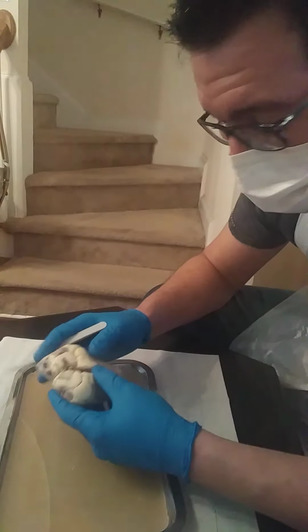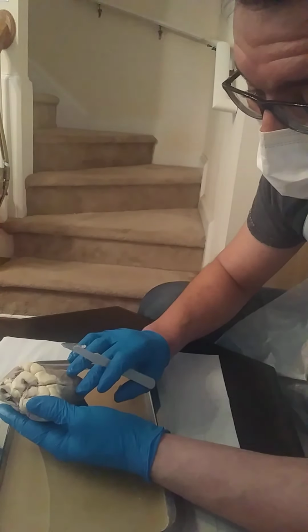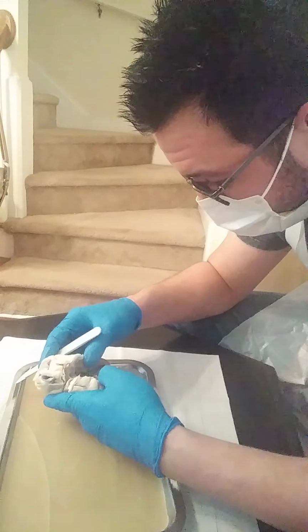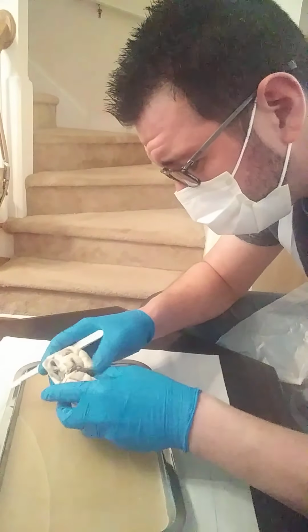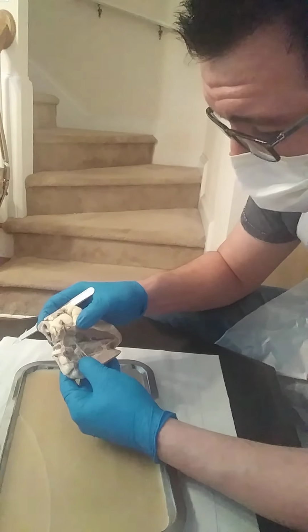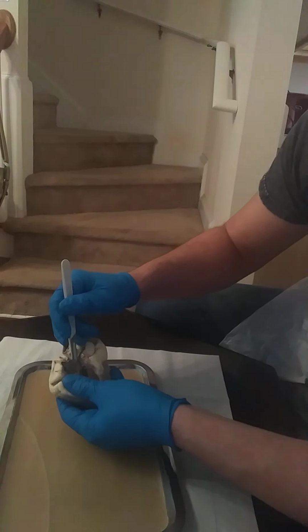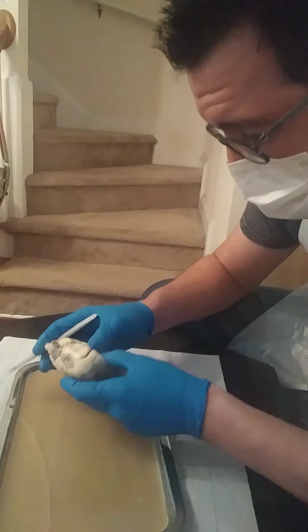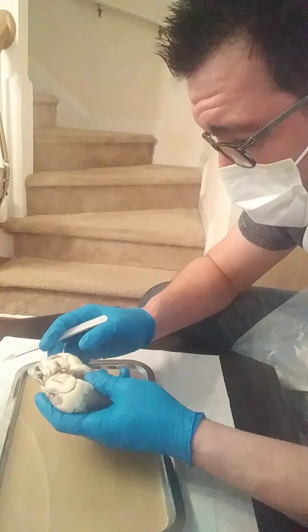The interventricular septum would be the bottom two parts, which I'm hoping to have cut through. Would be the bottom two portions of the ventricles, the wall that separates them. I'm gonna have to just cut it open a little bit more. There we go. There it is. All right, that's a little bit better. Okay, so here is the tricuspid valve, and here are the papillary muscles, right there. And let's see if I could crack open the left ventricle a little bit more.